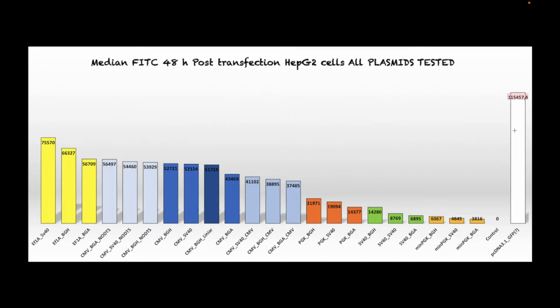However, as you can see, you cannot compare their median fluorescence directly because, of course, it's a different gene, with different fluorescences, but I can compare the decrease in fluorescence. So I know it's not ideal, but what can you do? This is what I've done.